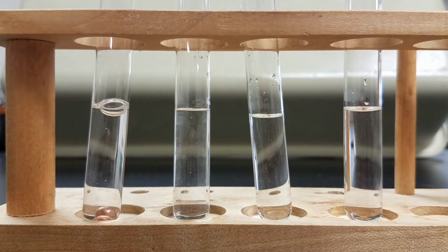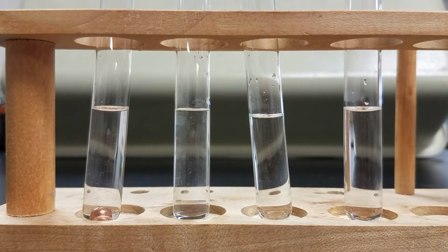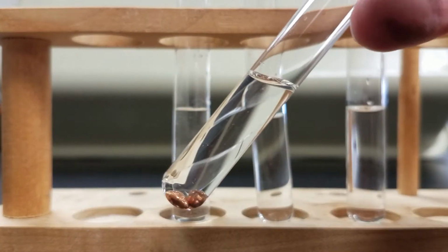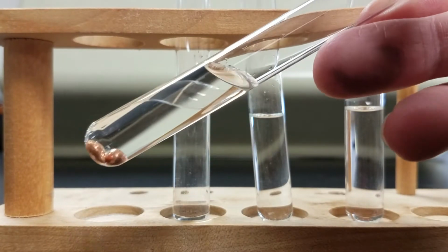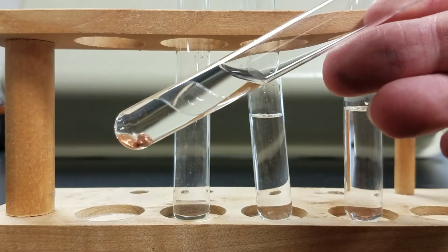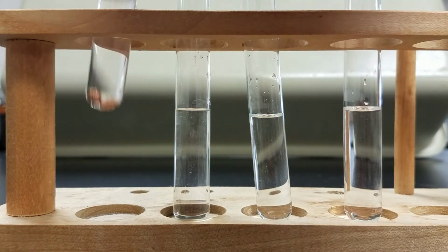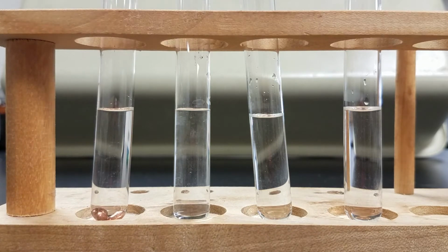Put a couple little pieces of copper in there, and there is no reaction that is taking place. There's nothing happening, no bubbling, no fizzing, no color change. So we would say that that would be a no reaction.